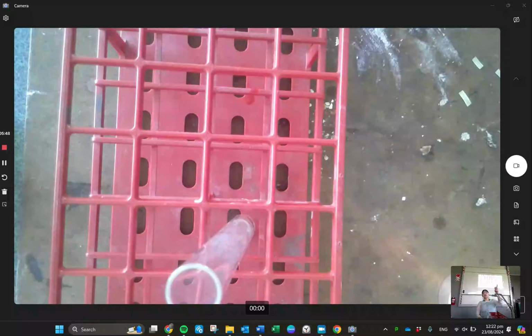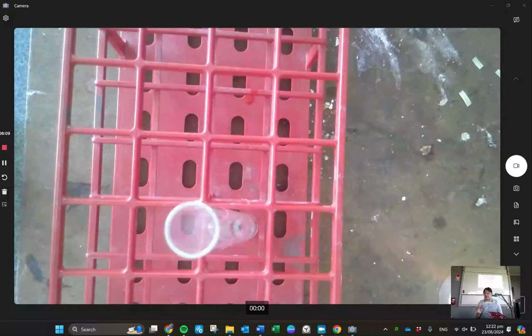You could also do this with the boiling tube, having the reaction, and you can trap the gas with a flask, and it makes a bigger pop. So I'm happy if you want to do that too. I did bring out the flask, so feel free to have a little play, but make sure you do the write-up at some point, either today or as homework. Okay? That's us. Have fun. I'm also going to do burning magnesium today, but I think I'll leave that for Monday, so you guys have some practical for them too.